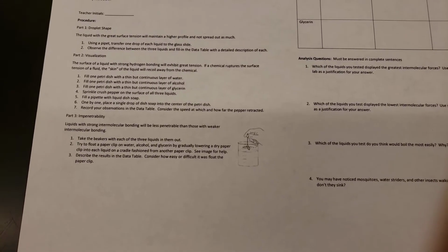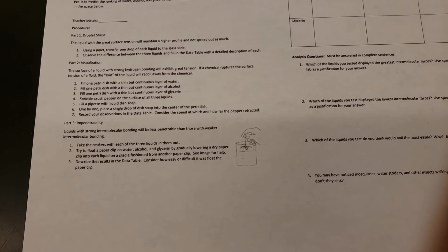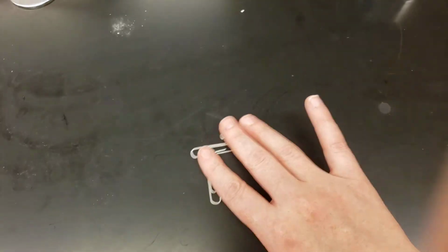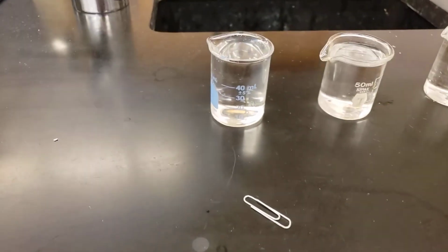Last but not least, we are going to be determining the impenetrability of these different substances. So liquids with strong intermolecular bonding will be less penetrable than those with weaker intermolecular bonding. We are going to do that by using paper clips. The easier it is to float a paper clip on the liquid, or how quickly the paper clip falls through that liquid if we can't get it to float, is going to help us determine how impenetrable it is.